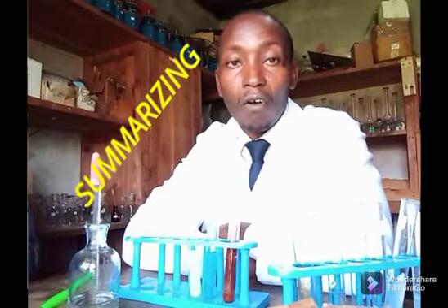So again, what has happened? Another very interesting chemistry has taken place. We've added with the magnesium, barium, and I even had calcium. All of them gave a white precipitate that was insoluble in excess of sodium hydroxide.